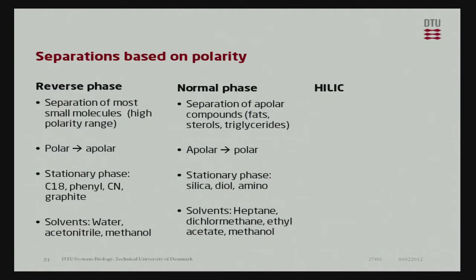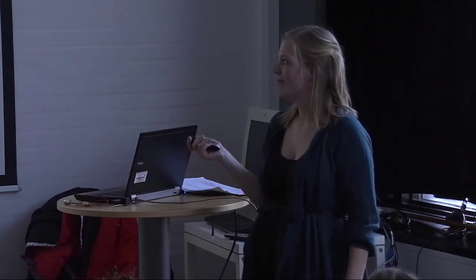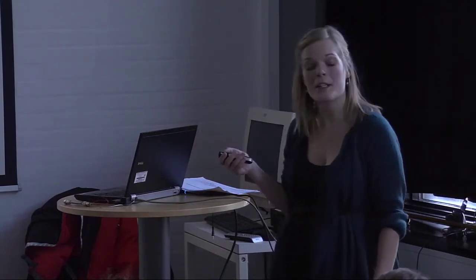And this is one of the reasons why normal phase is not necessarily good for interfacing with MS, because we need some water, actually. Water is good for making ions. So this is not something that you will usually connect with your MS. Another thing is that a lot of these solvents actually have great UV absorption, which means that we can't see the compounds that we want to detect by UV. So it gives a lot more background. But it can still be very good for separating compounds. And then we have to use other types of detectors, and Christian will talk about that later this afternoon.